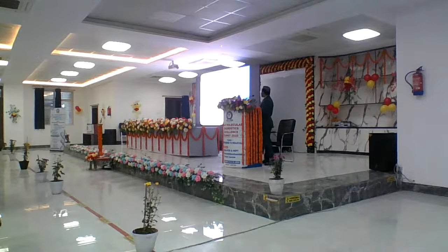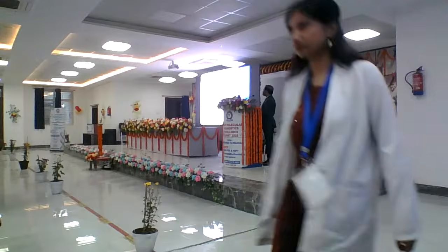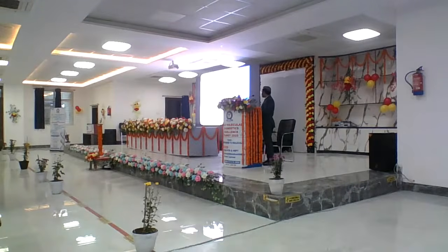Now, limitations. The most important advantage was the uniform size of droplets for your quantification, and the most important limitation also becomes variability in the size of the droplet. And as a droplet generator and analyzer are needed, multiple instruments are needed. So it is obviously time consuming, and there are so many pipelines, oil and droplets and other things, and proprietary chemicals. So there is obviously a risk of cross contamination.